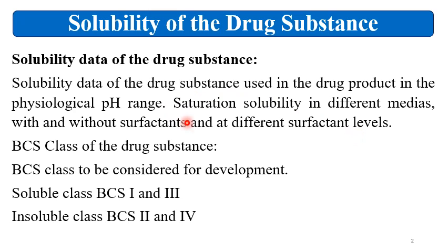This saturation solubility will help you find out the sink conditions and also the requirement of surfactant for dissolution testing.